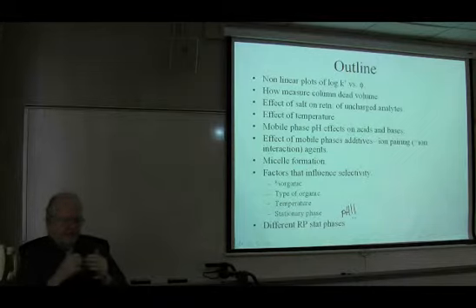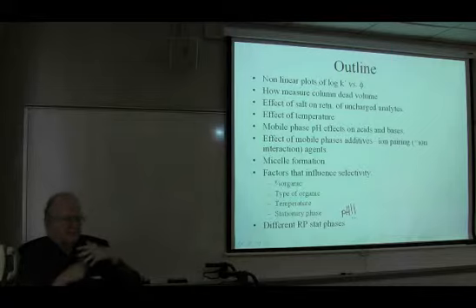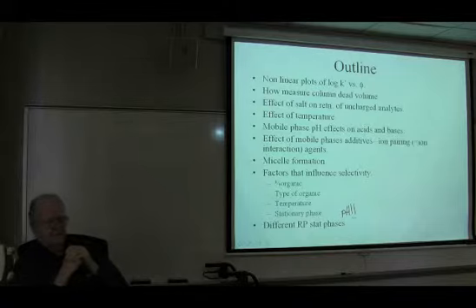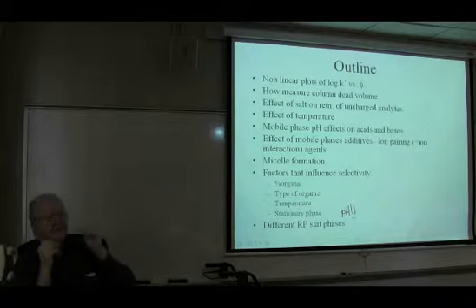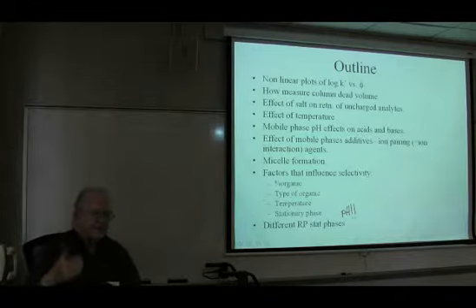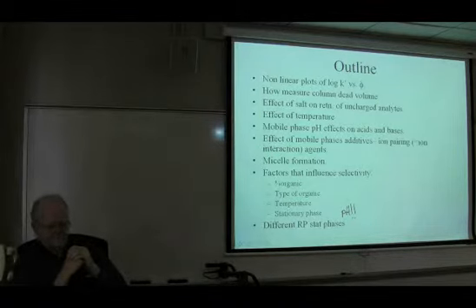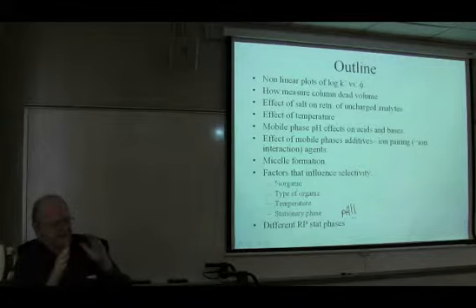And generally speaking, a plot of the logarithm of the retention factor, not the logarithm of the retention volume, not the logarithm of the retention time, but the logarithm of the retention factor, is a reasonably linear function of the volume fraction of the organic modifier, not the mole fraction, not the concentration of the organic in moles per liter, but the volume fraction of the organic modifier. It's not an exact relationship, but it's a pretty good relationship.